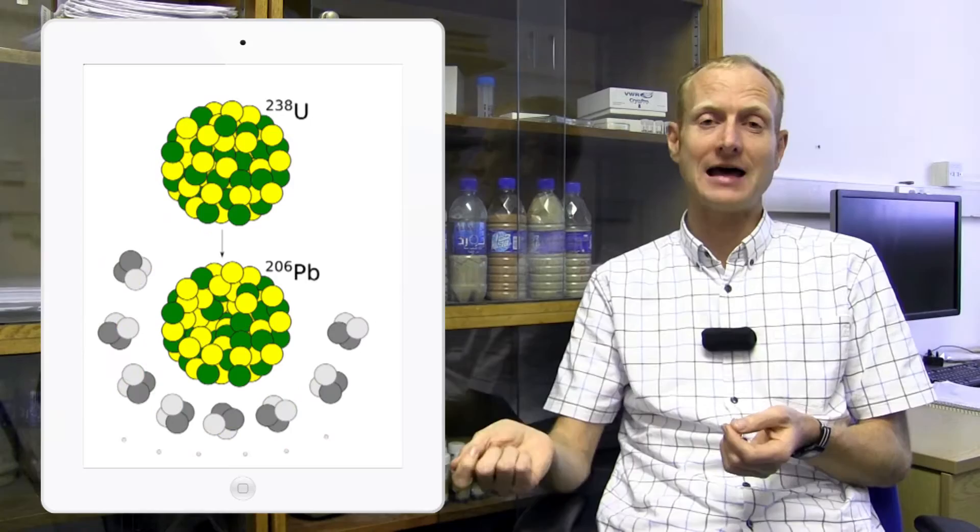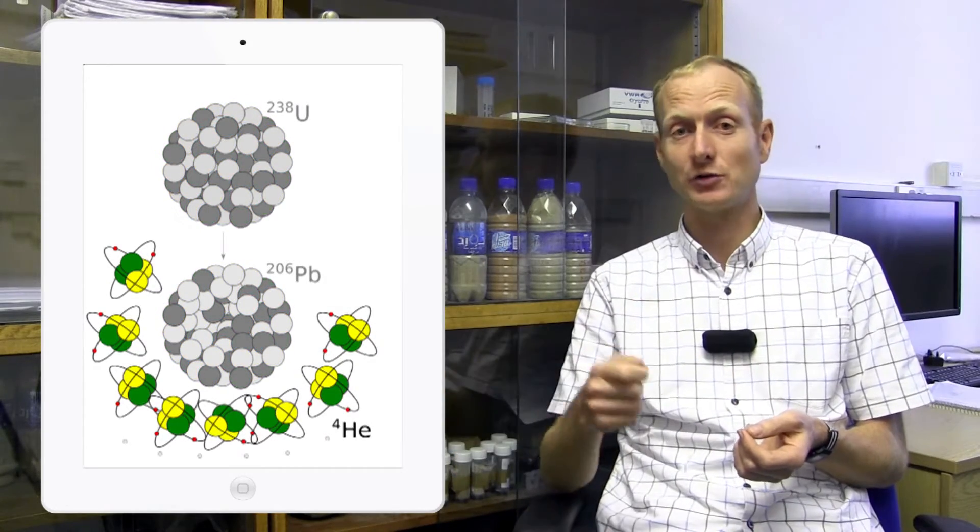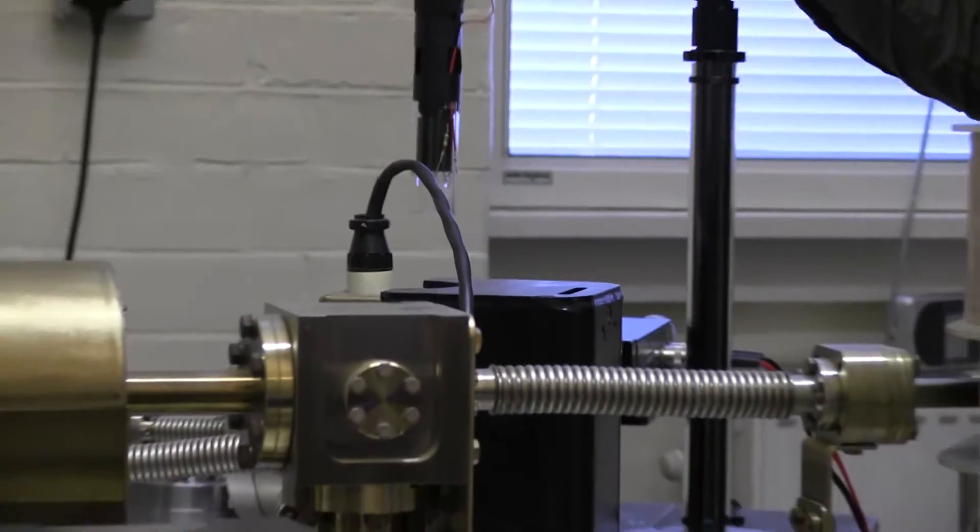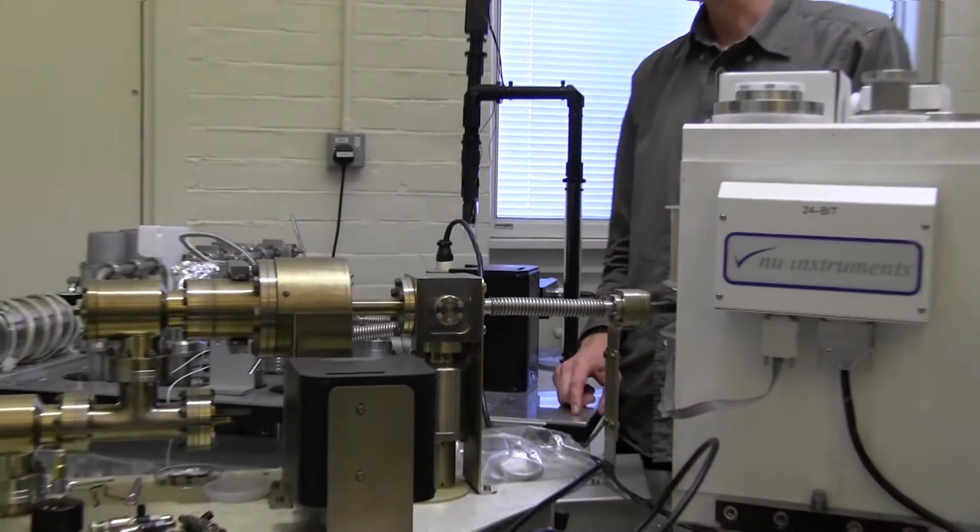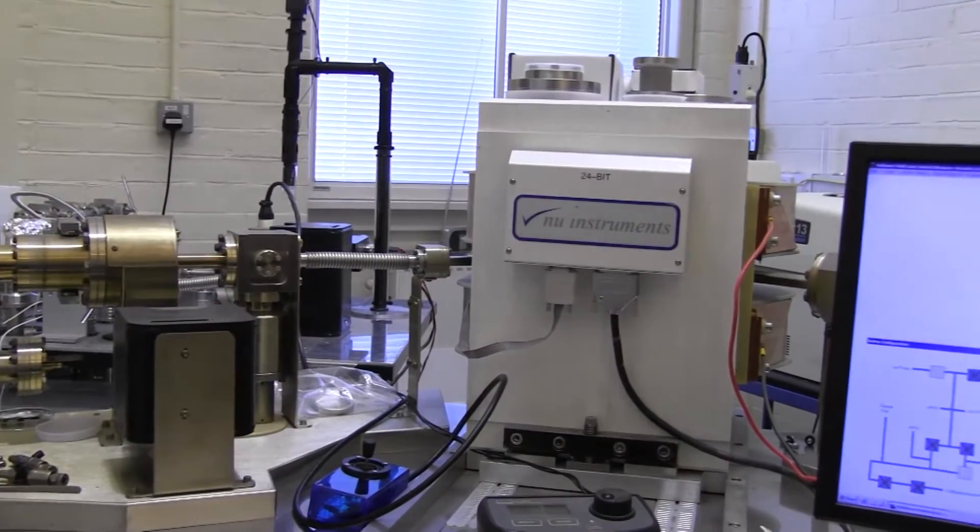We can measure the ratio of lead to uranium and of helium to uranium with an instrument called a mass spectrometer, and we've got three of those installed here at the London Geochronology Centre.